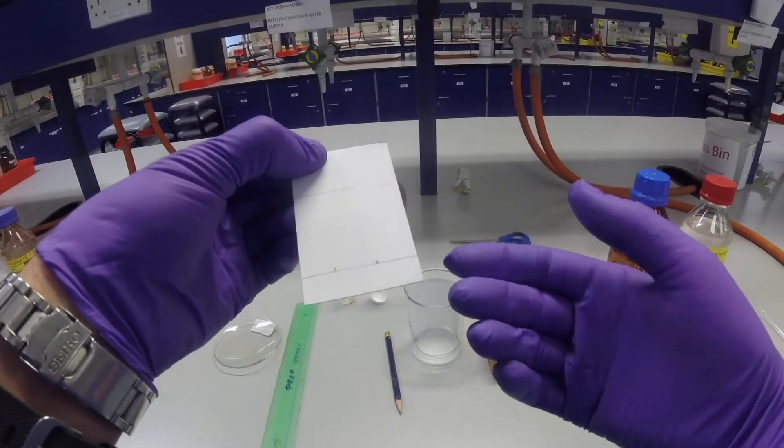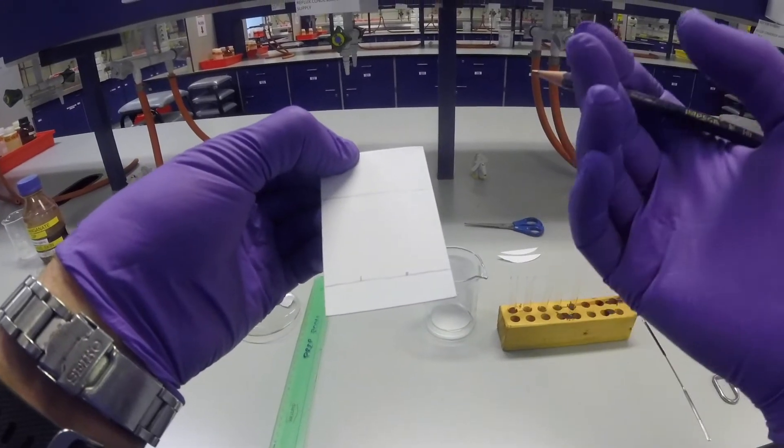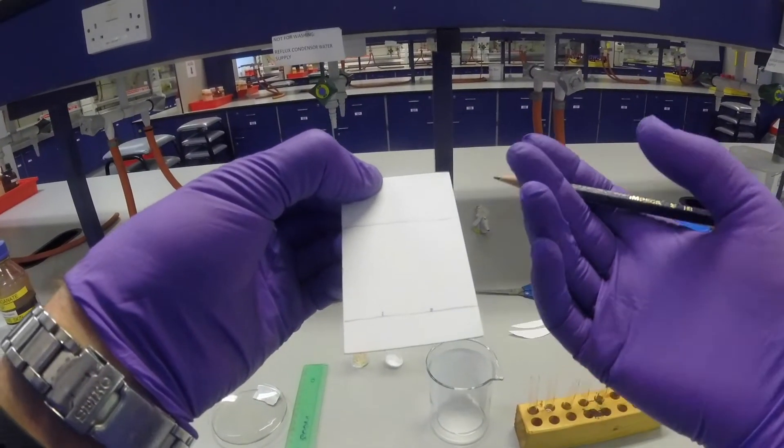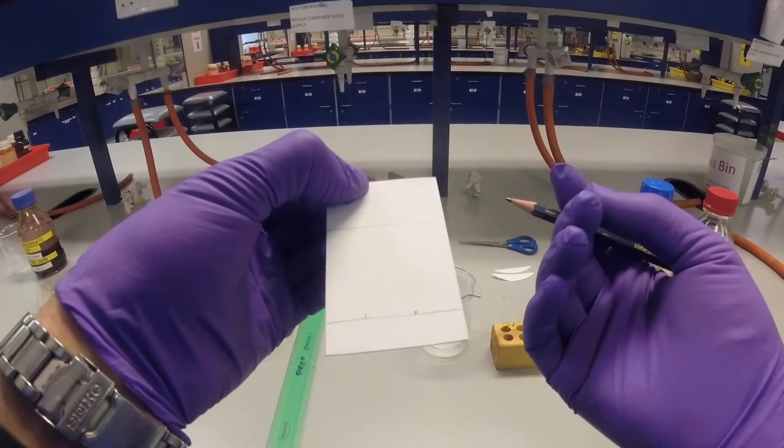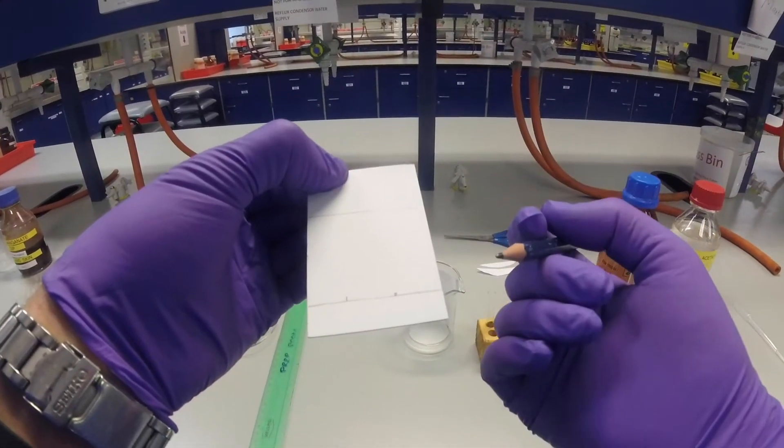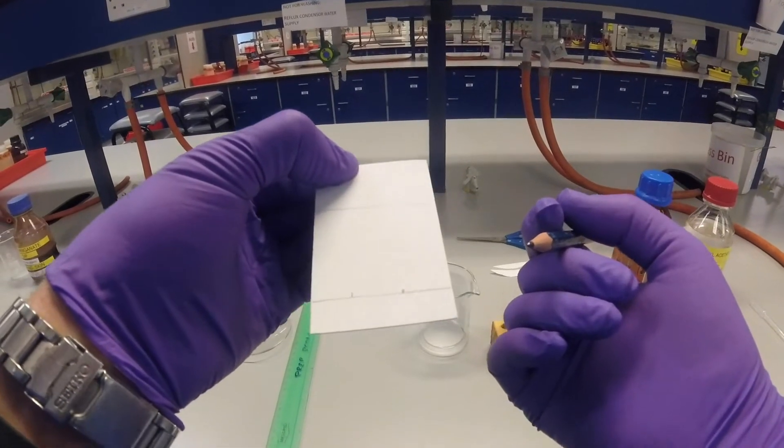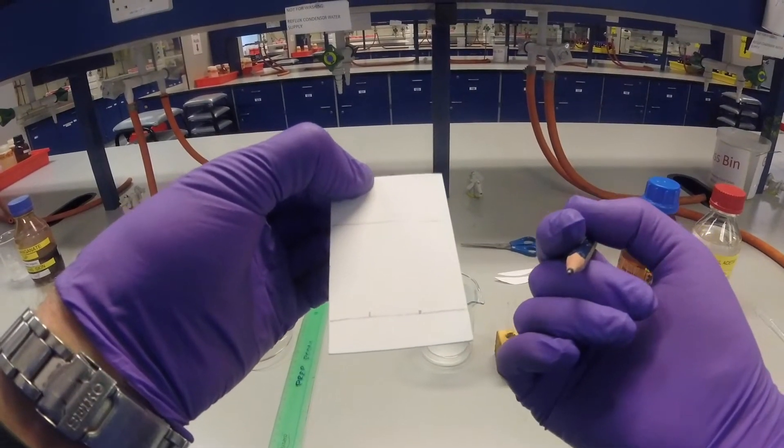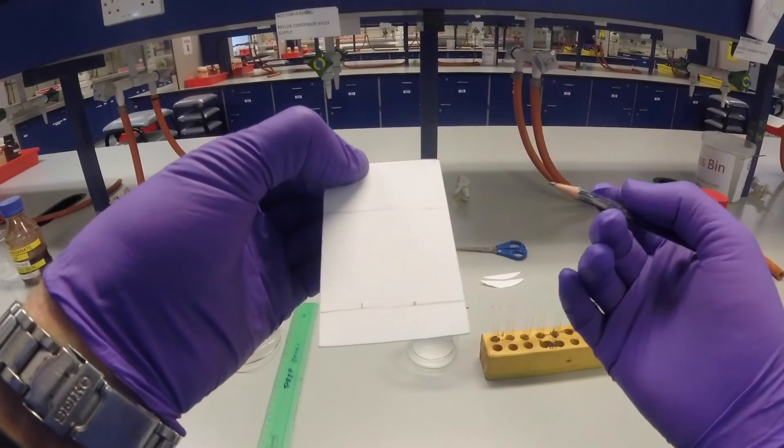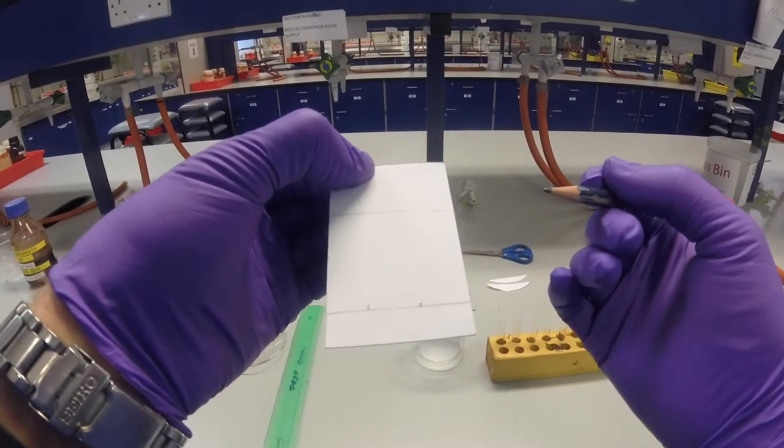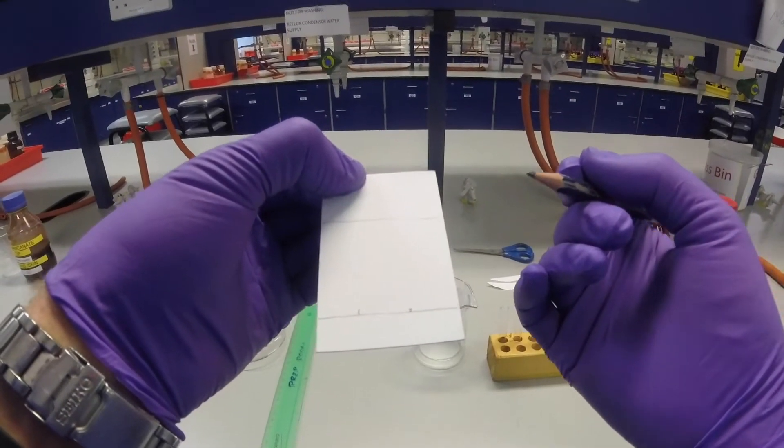Obviously we can't see our compound, so we need a way of visualizing where our spots have reached on the plate. There are two ways of doing this. If your compound has lots of aromatic nature, conjugation, so it absorbs UV light, we can use UV light to see where that compound is. These plates have been impregnated with a fluorescent dye that glows under short wavelength UV light, 254 nanometers. If you put this plate under UV light at 254 nanometers, the plate will glow a bluey green color. But if there are any compounds that absorb UV light on the plate, they will absorb the UV light instead, and you get dark patches, spots, where those compounds are.